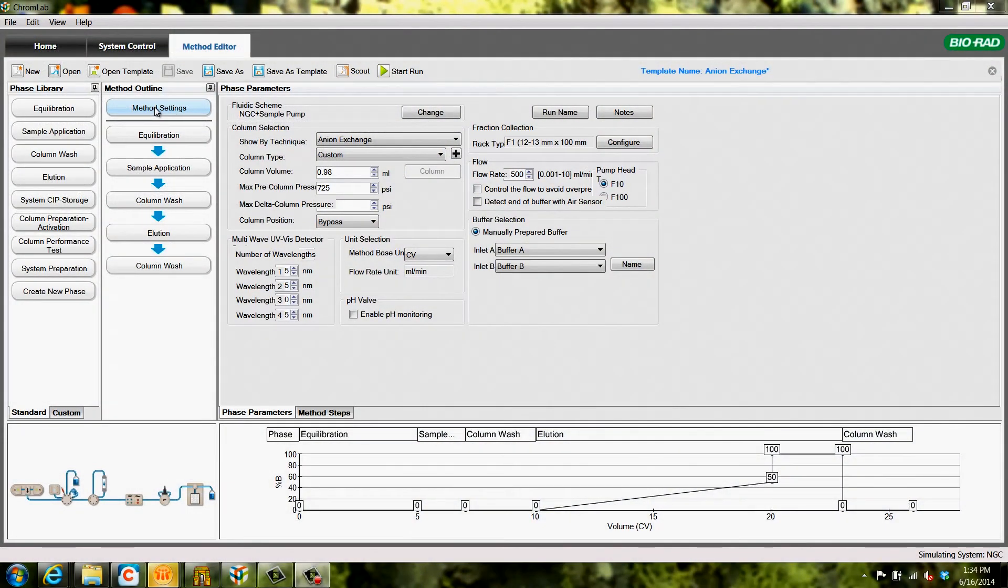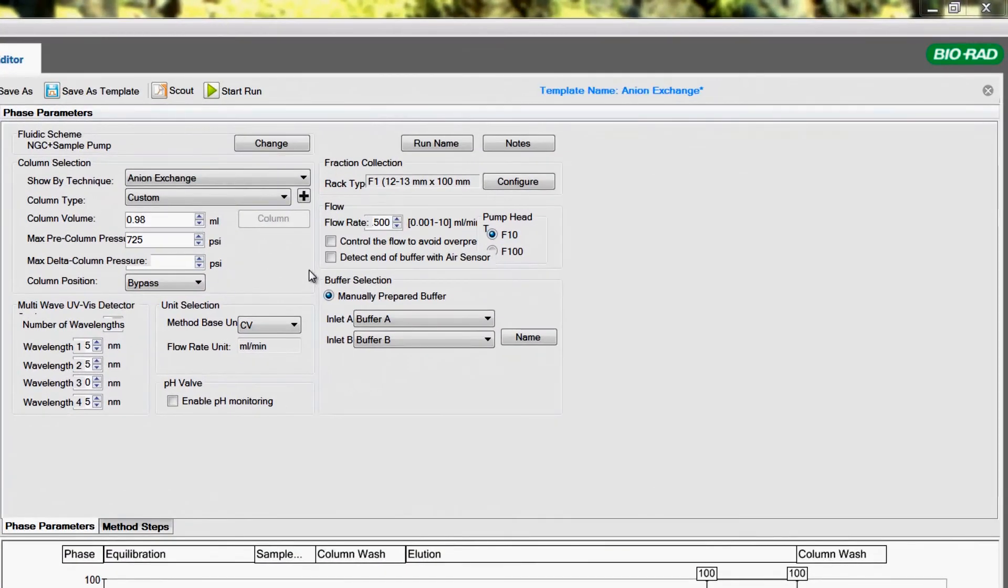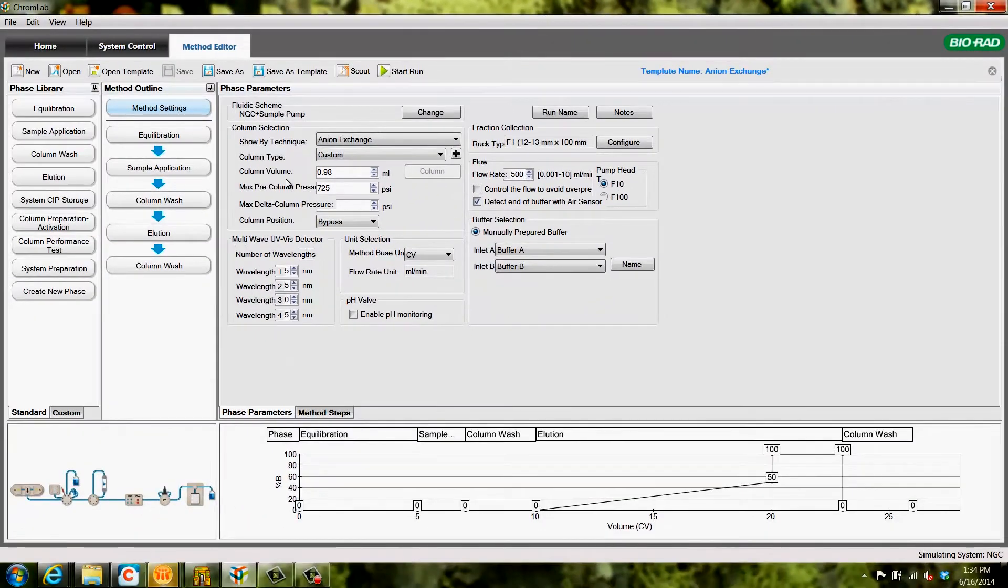During method setup, check the box in method settings next to detect end of buffer with air sensor.